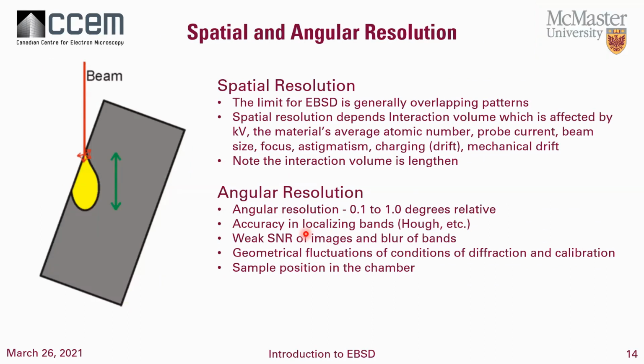Well, the problem with grain size is usually where the grain boundaries are. You generally want a fine enough step size, assuming you have a field emission microscope to make a small enough spot, that you can get enough data within the grain to define it.